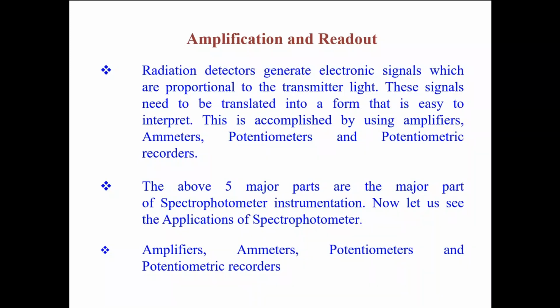So in yesterday's class, we discussed what samples and monochromators are, right? We saw the monochromators prepared by using a prism, and we also discussed the wavelength selectors like diffraction grating and all. And then we saw which is important and which has more applicability in the instruments. That's what we saw.